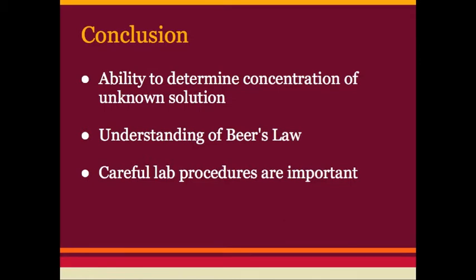From this lab, we learned how to utilize the Logger Pro software and the line of best fit to determine the unknown concentration of a cobalt-2 chloride solution. We also incorporated Beer's law, which states that the concentration of a solution is directly proportional to its absorbance. Finally, we learned the importance of meticulous lab methods, as our huge percent error shows that we need to be more careful.